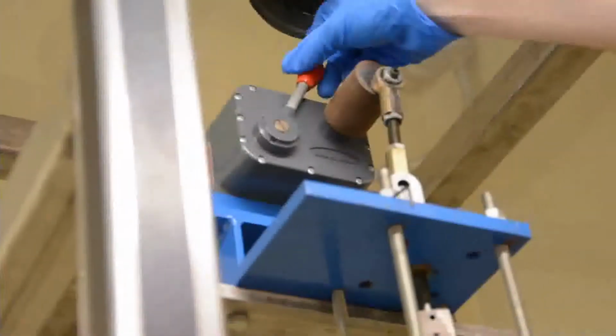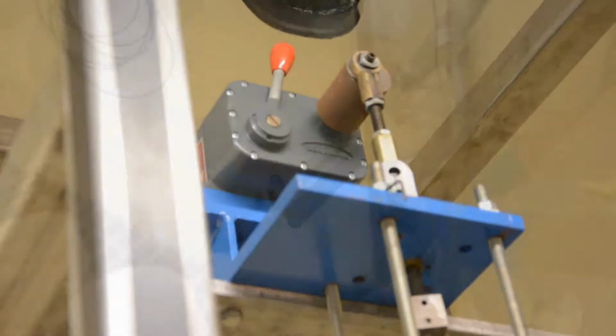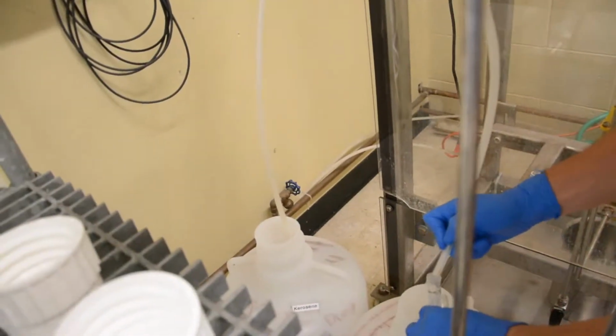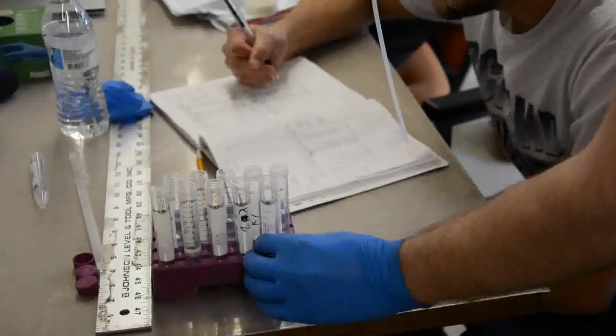Seventh, once the column is filled up, adjust the heavy phase valve to keep the phase separation between the two pipes. Eighth, turn on the agitator at the top of the column to make the data a function of the agitation rate. Ninth, continue adjusting the heavy phase valve and collect samples over time from the raffinate and extract tubes.